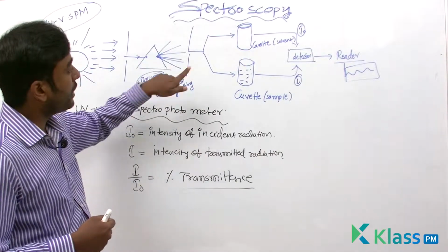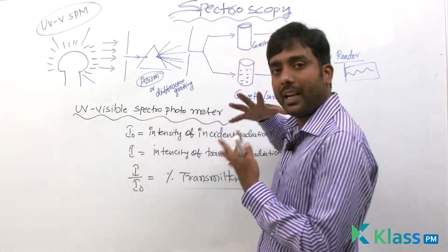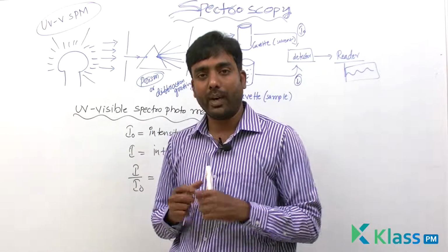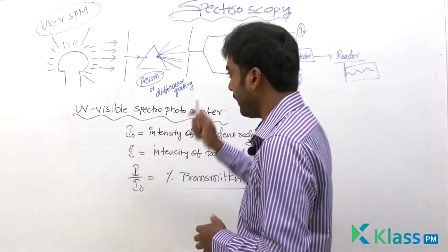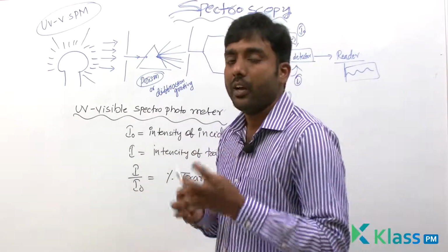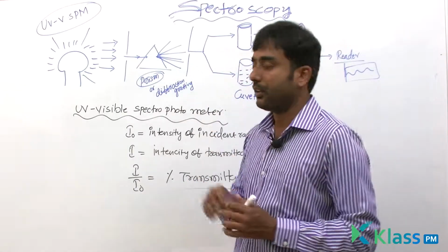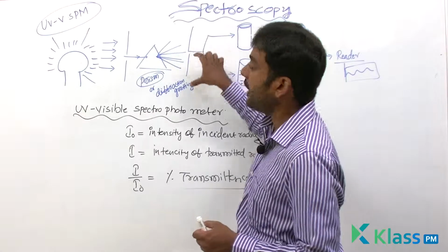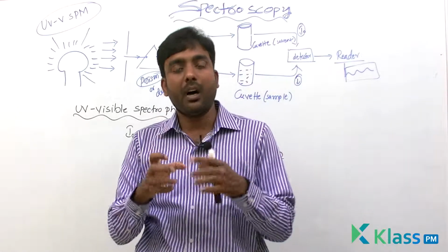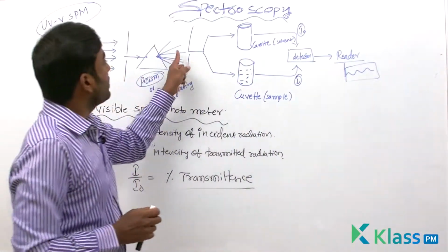And here one more slit will be there. For our selected sample, a particular wavelength or range of wavelengths is required. Which wavelength is required? Like we need violet, or indigo, or red, or blue, or green. Only that wavelength can be sent through the slit. By adjusting its angle, you can send, among all those wavelengths, whichever wavelength or range of wavelengths you need through this slit.